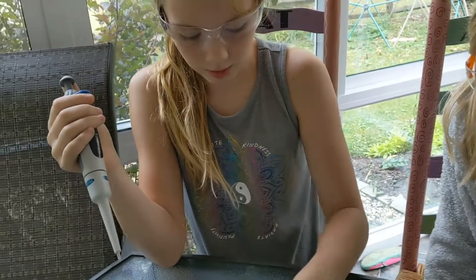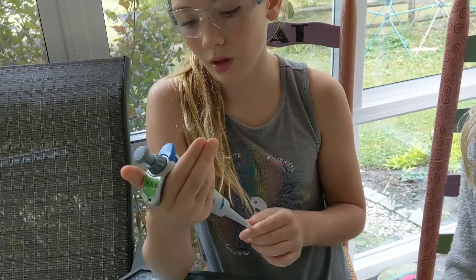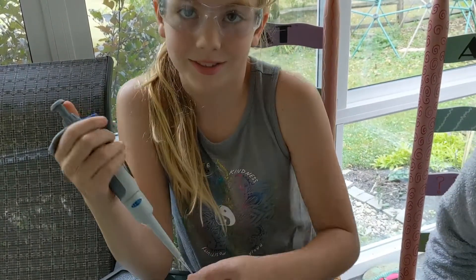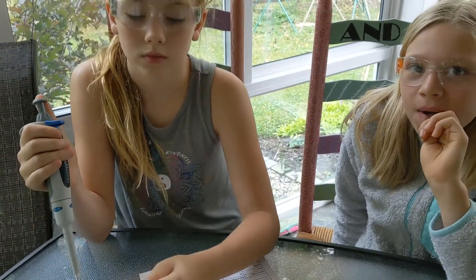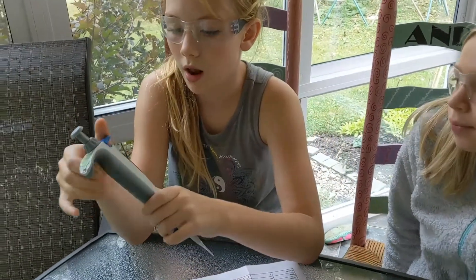What are we going to set the pipette to for green? You've got the complicated one. Rowan, help her out. Setting it to 7.5. And how many 7.5's make 15? Two. So you've got to set it to 7.5 and then do it twice.